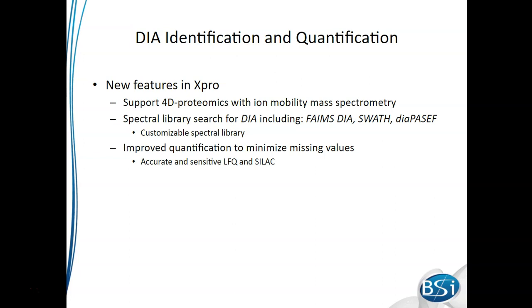Several different instrument vendors have their own way of dealing with ion mobility data, such as FAIMS, SWATH, diaPASEF, and MSE. In PEAKS Xpro, we support all of these. Also, we're able to support DIA data with ion mobility.